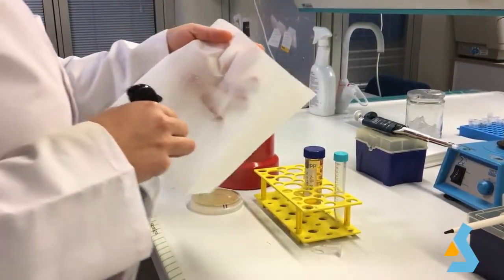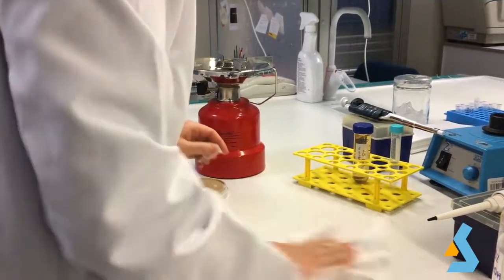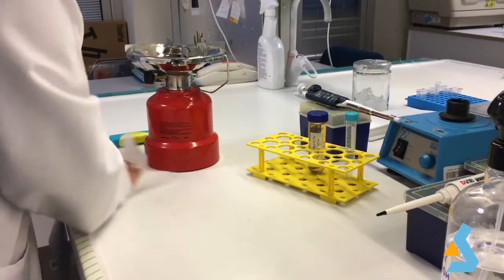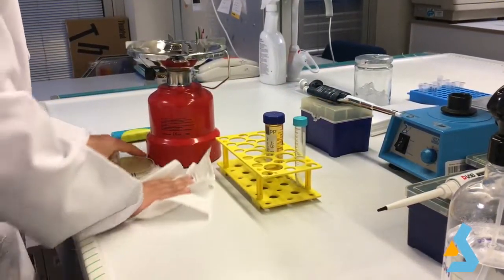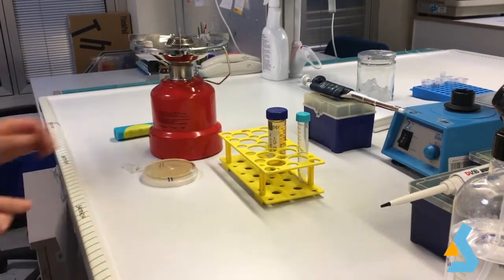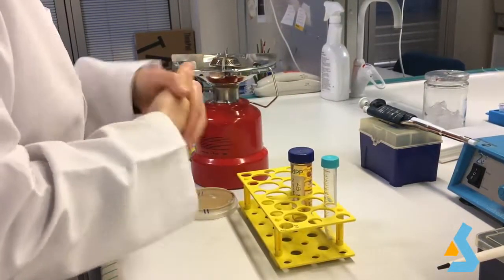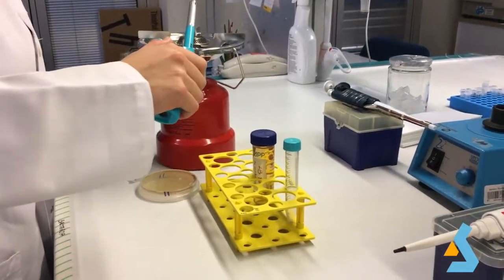In the first day of the experiment, we inoculated one of the colonies formed on an agar plate in the LB medium containing a selective antibiotic. Since this is a bacterial protocol, we need to work in a sterilized environment. To do so, we first clean the bench with 70% ethanol. Here we do not use gloves in case of getting burned in the open fire. The reason why we work close to fire is to eliminate the possible contaminants in the air.